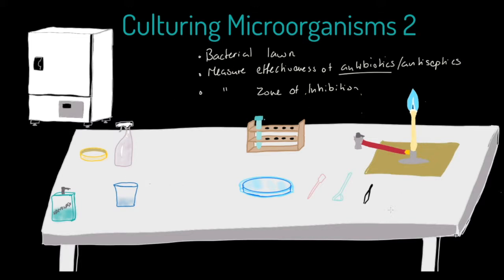Now, I'm not going to be as deliberate as I've been previously in exactly how we set up this experiment and these processes. If you do prepare the bacterial lawn in your school, you're very, very likely to be following a very specific protocol, so I won't bore you by going through that. What I would say in advance, though, other than the general equipment that we've got available here, is I'll just introduce you to what we call the spreader. It's this little implement here. We've just hand drawn it.